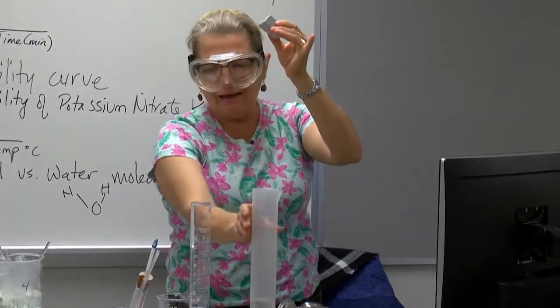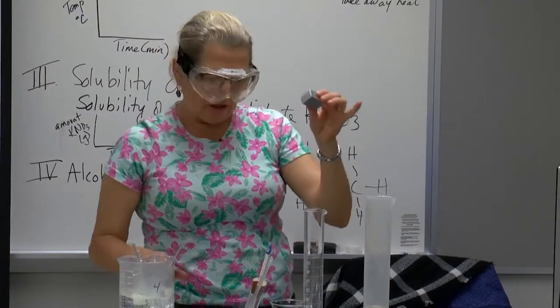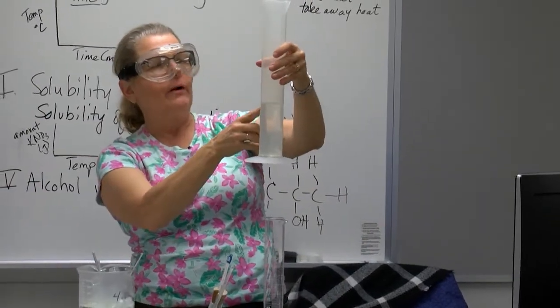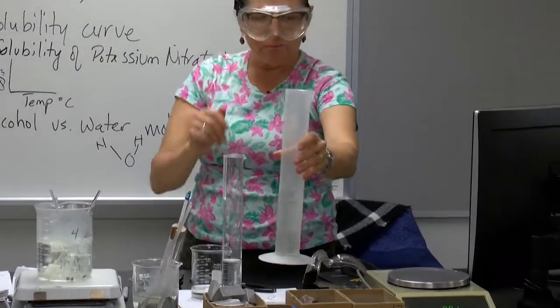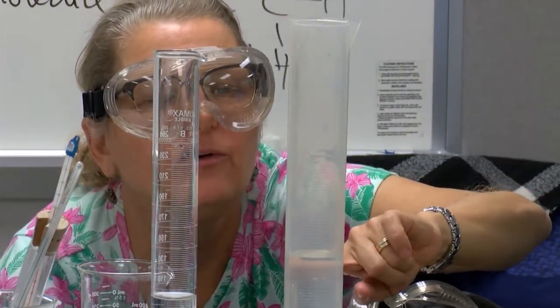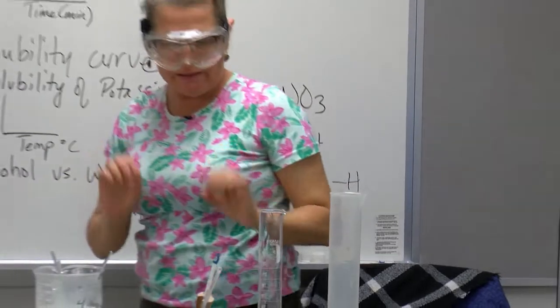Now, this is not a regularly shaped object, and so to find the volume, we can use water displacement. I'm starting out at 200.0 milliliters. I put this in, making sure I don't splash. I started out at 200.0, and wow, it's at 10, 20, 30, 240, and literally it's at 240.0.